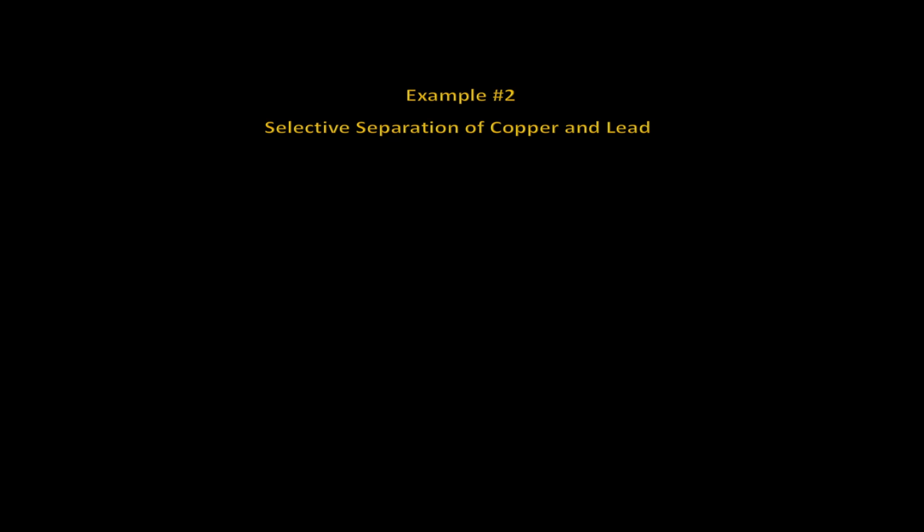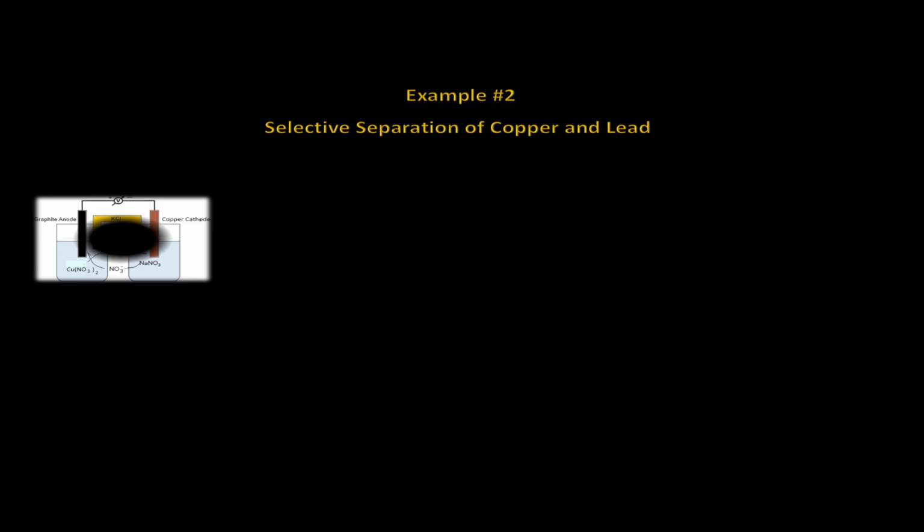There are times that you will need to separate species in a solution. Some samples and even scrap metal will contain both lead and copper. Note that the lead and the copper are both soluble in nitric acid. To stabilize the reaction and ion transfer, a salt bridge using potassium chloride should be used. 2 calculations will be needed, one for the copper and one for the lead.